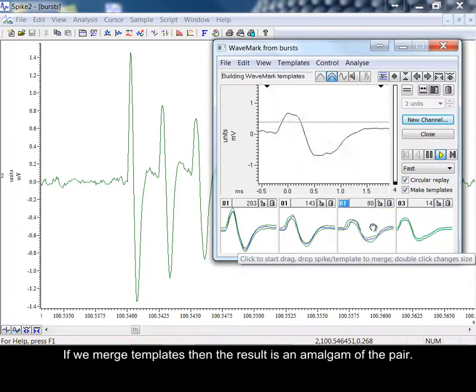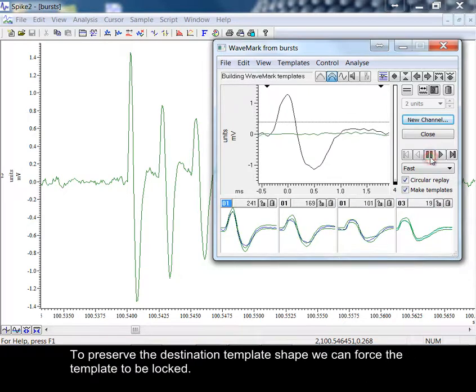If we merge templates, then the result is an amalgam of the pair. To preserve the destination template shape, we can force the template to be locked.